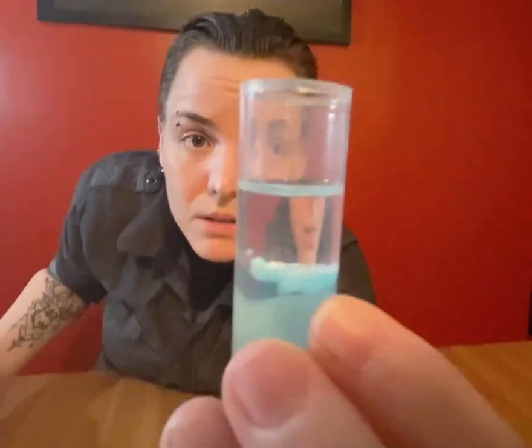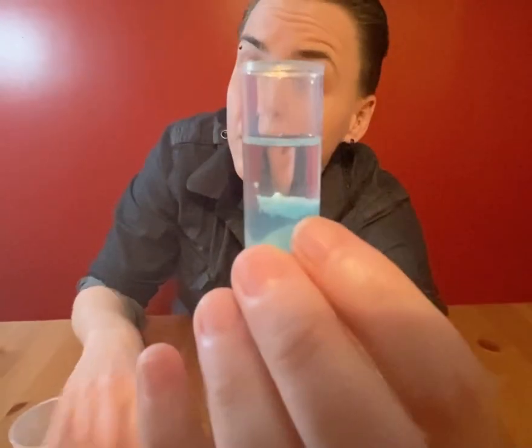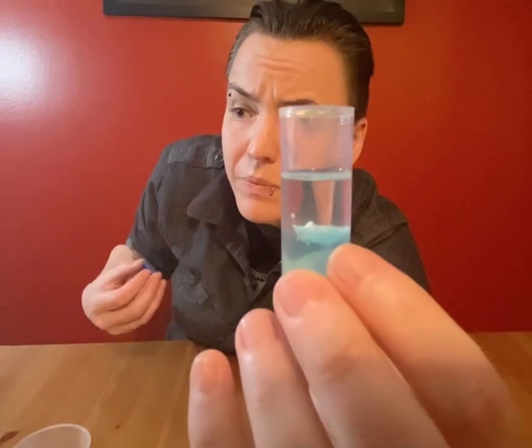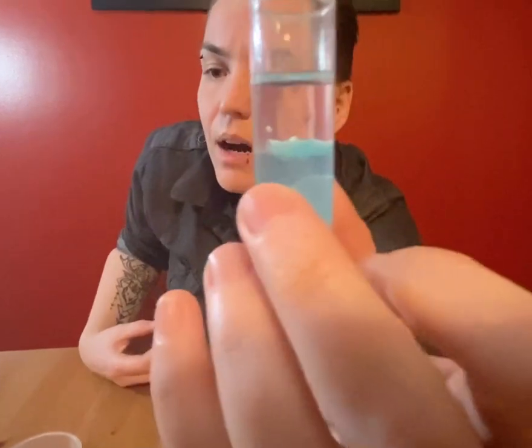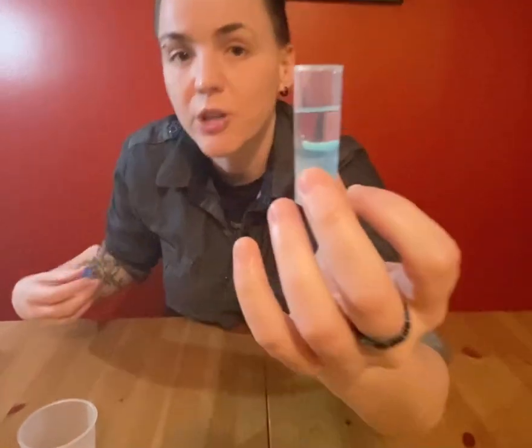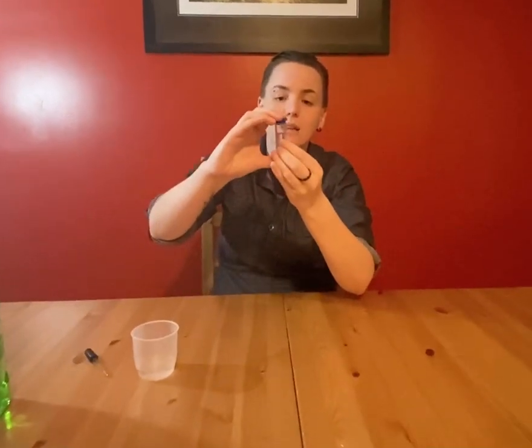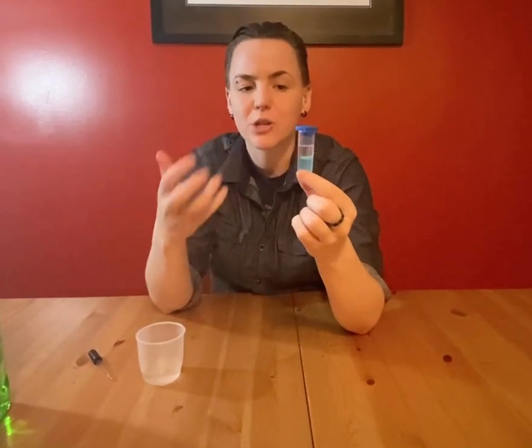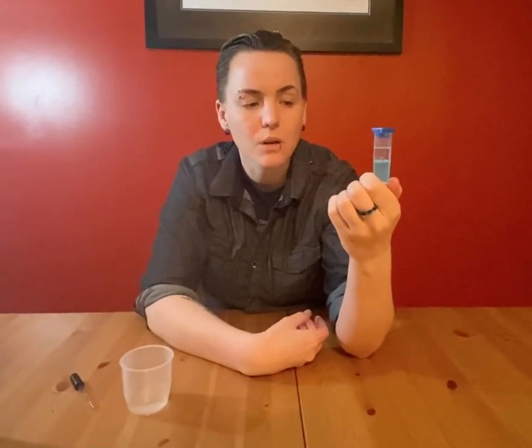So this is actually the scientific process of how we go about collecting DNA in a laboratory to do anything from criminal investigations to determining how primates, like humans and apes and all their ancestors, are related to each other, to how human diseases are passed on from one generation to another. So yeah, this is a really neat experiment. If you want to keep it, you can. After a few more minutes, this will actually have a lot more genetic material that will appear in it. But yeah, try it at home and see how it works out for you.